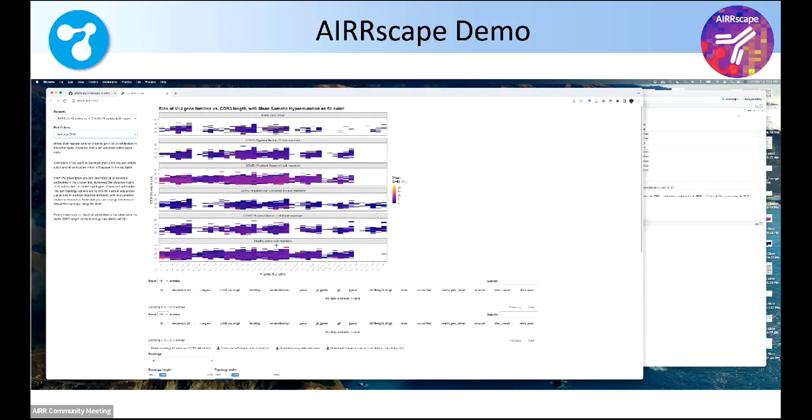So just to show you what's going on, again, it's pretty small, but across the x-axis are all the unique V plus J germline combinations, V family. Otherwise, there'd be too many, right? And then on the y-axis, CDR3 length.